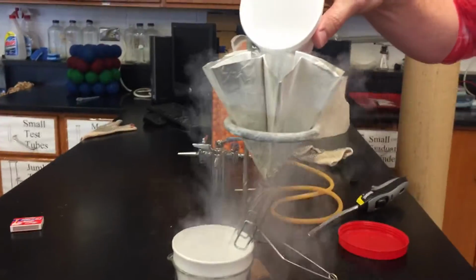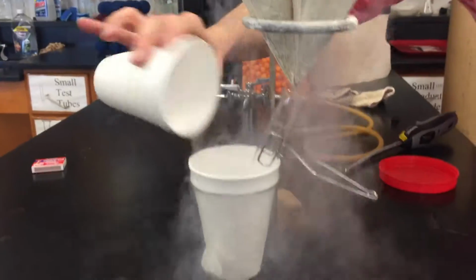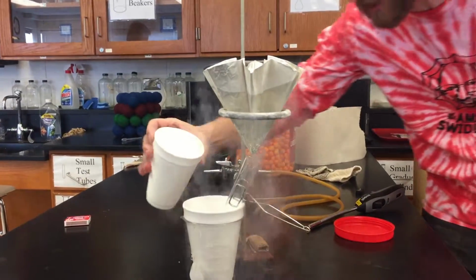I'm going to pour a little bit more in here so I can create even more liquid oxygen. And I'm going to pour some into this cup to cool down the test tube that's in there so that my oxygen doesn't boil away right away. Now, both nitrogen and oxygen have London dispersion forces between them. But whose London dispersion forces are stronger?